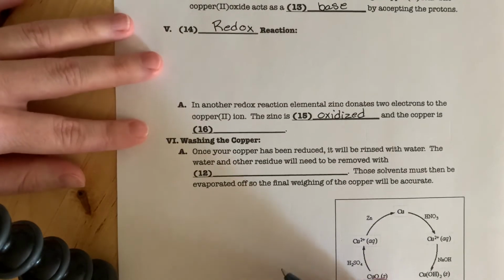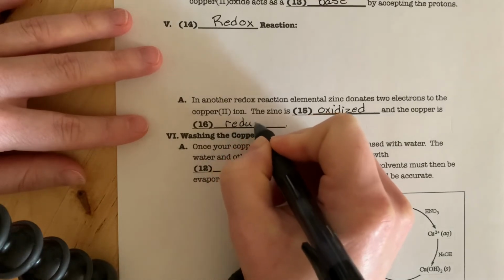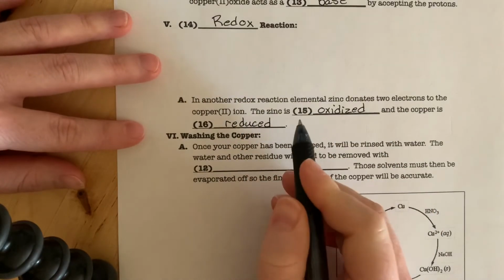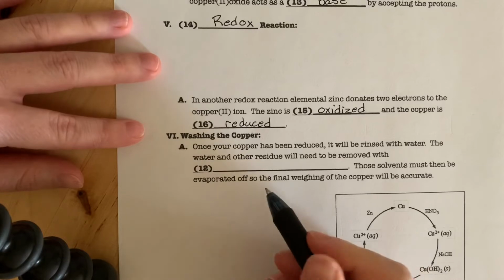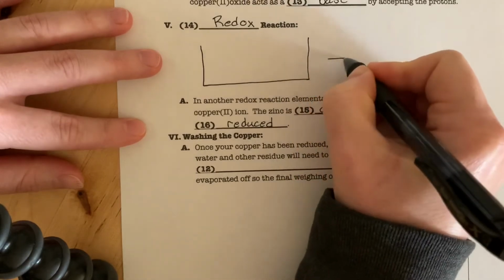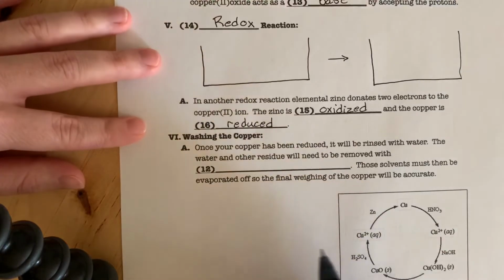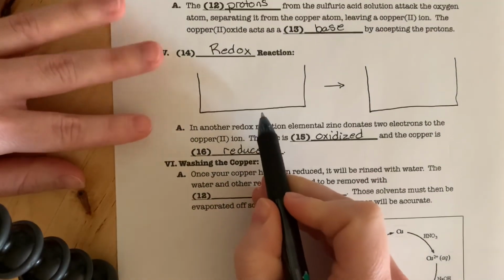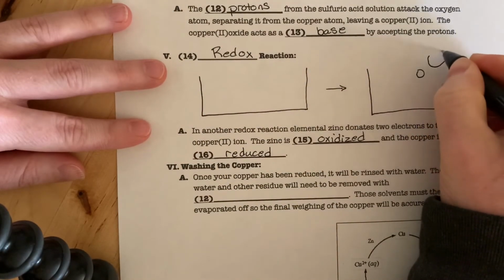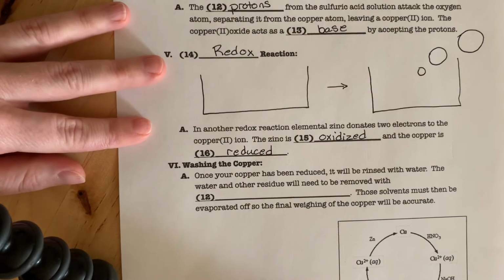And that is in turn going to leave the copper reduced. When the copper is reduced, it's restored to its zero oxidation state, which is its elemental state. So make sure you account for both reactions when you draw your principal species in solution. And I will give you a hint here that you do have some gas coming off there, so you can figure out what that is.